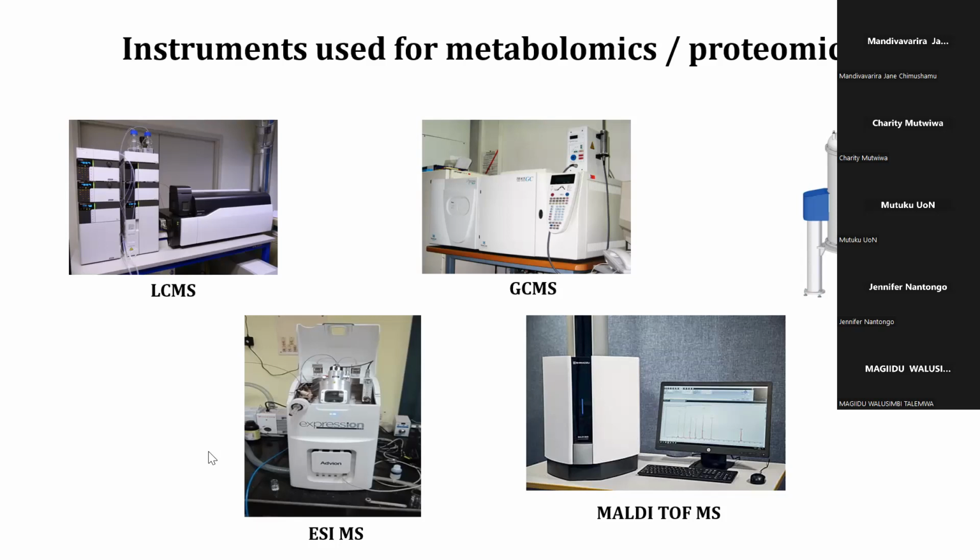And here you have nuclear magnetic resonance, that is NMR. You also have ESIMS, that is electrospray ionization mass spectrometry. And this is MALDI-TOF, that is matrix-assisted laser desorption ionization and time of flight. It's so difficult to remember this big name.